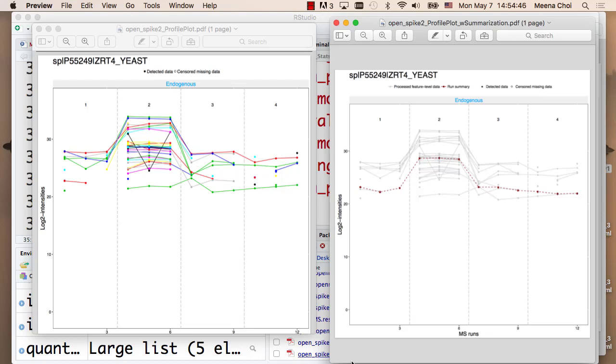The reason why I want to show this is that the data itself will be different depending on the processing tool, because they have different algorithms for filtering, quantification, and so on. So you have to be careful about this. So that is for our processing part.